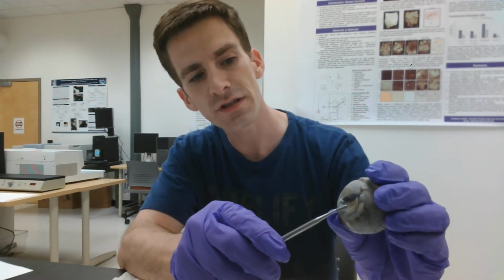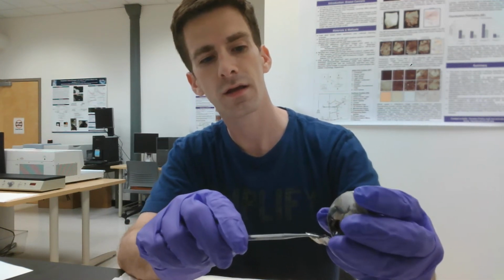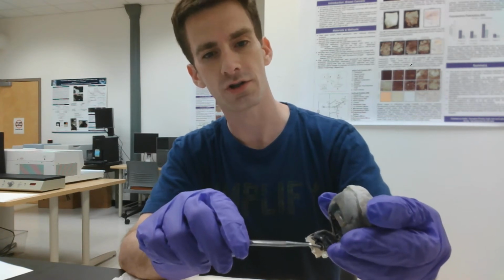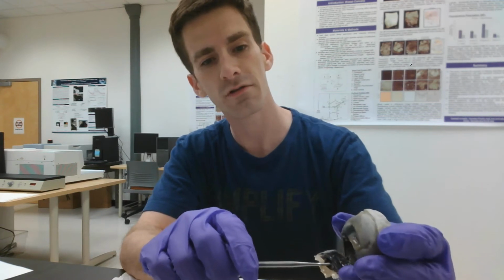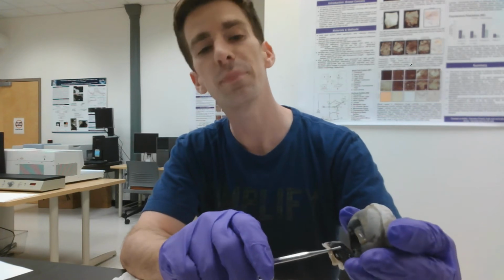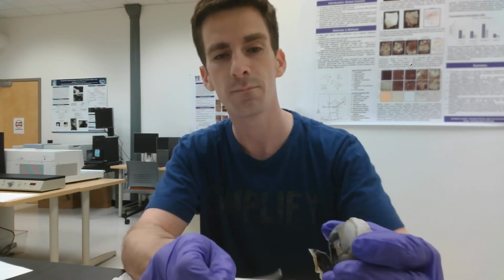So here you can see me pointing to the cornea. The cornea is the tissue through which the light enters into the eye. And if you peel back the cornea, here you can see this dark colored structure, which is the iris. The iris helps to control the amount of light that's allowed to enter into the eye. So here is the iris, and you can see here and also here the pupil, which is the hole in the iris that ultimately allows light to be transmitted through the eye to the retina all the way at the back, which we'll get to in a minute.